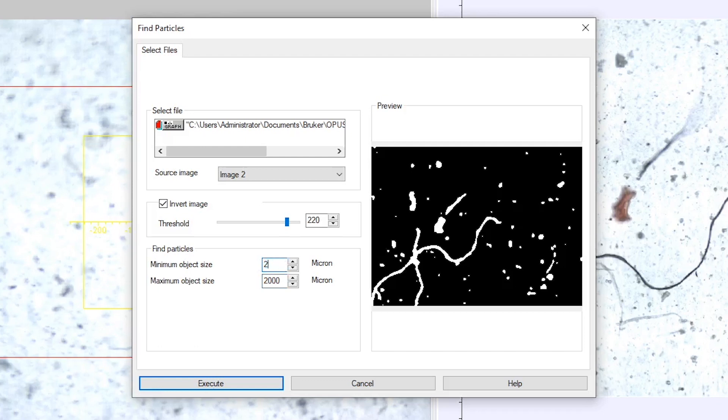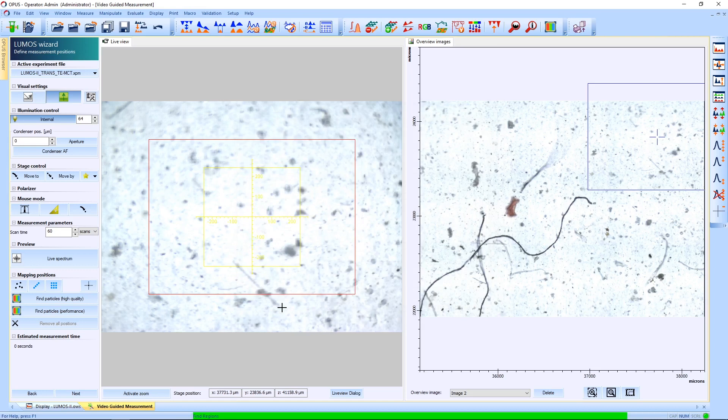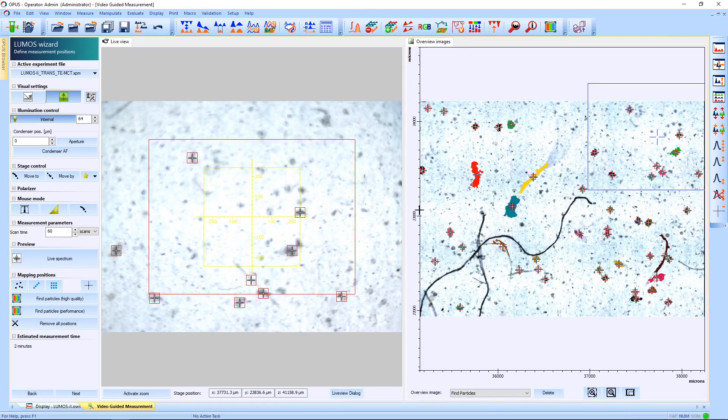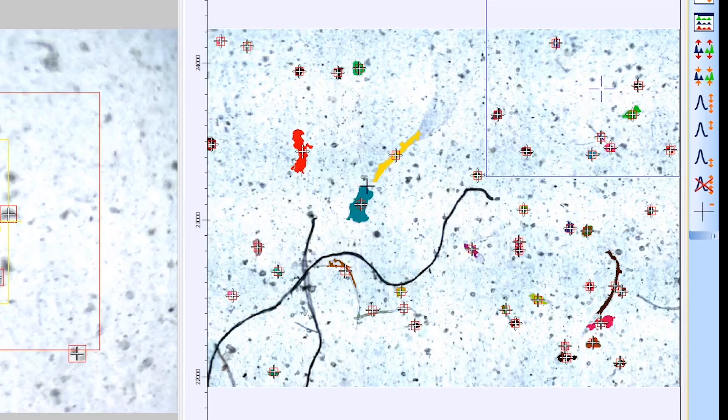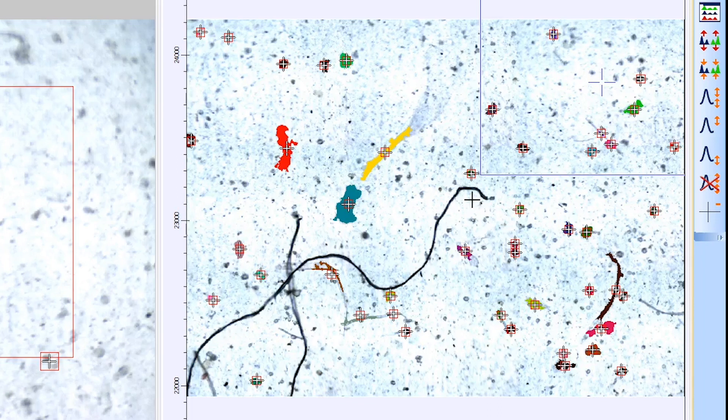You can adjust this to any value you like, but we're going to stick with 50 and 2,000 to show you the selectivity of the feature. This also means this large fiber here will not show up in the final result. Found particles are shown in different colors and larger objects like this fiber and smaller particles are not selected due to the size restrictions we have set.